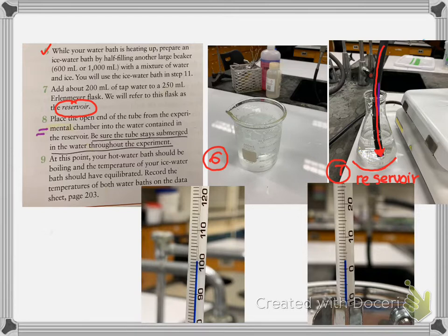Now step 9, this is where we're going to record our measurements. At this point it says your boiling water should be boiling, and it was, and your ice water should be equilibrated, and it was. So we're going to record our first piece of data, this picture right here. This shows my boiling water bath.